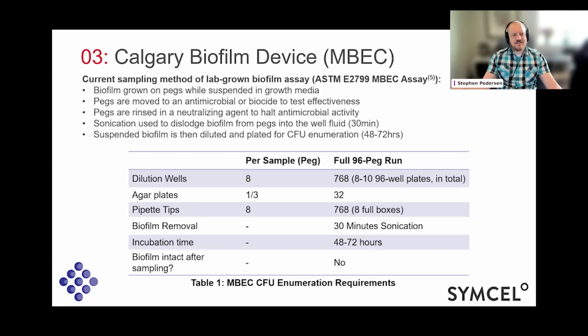It goes through a 30-minute sonication step. The biofilm is then in a suspended fluid. It's diluted and plated for incubation, and then you get a CFU enumeration at the end of that.